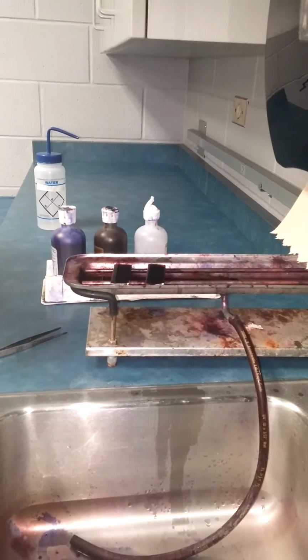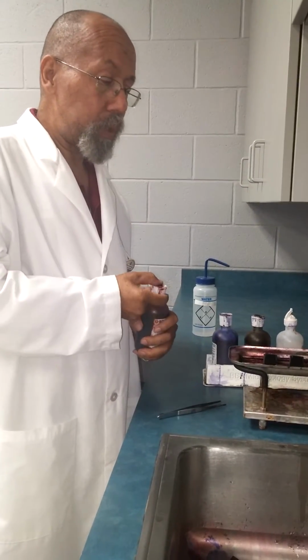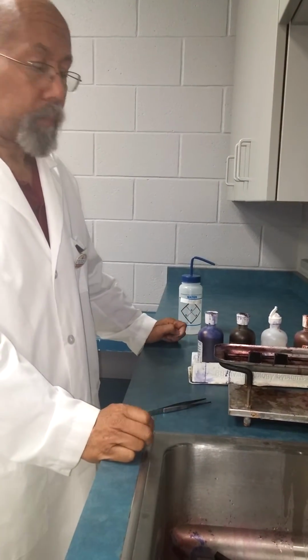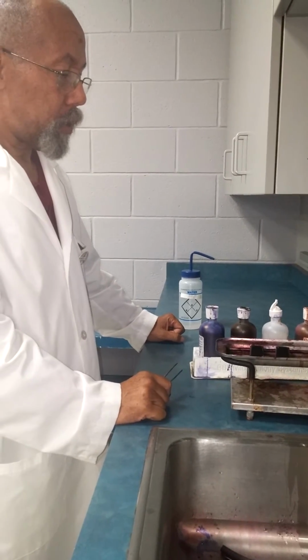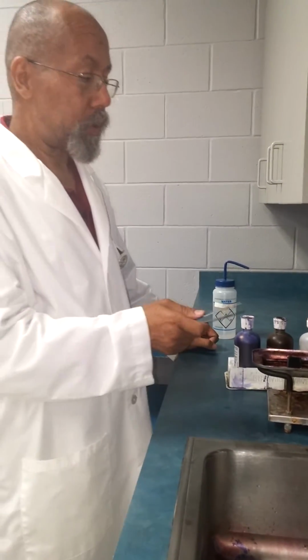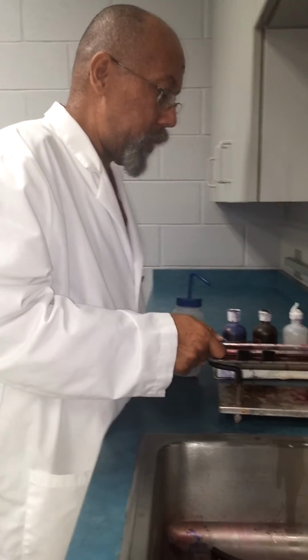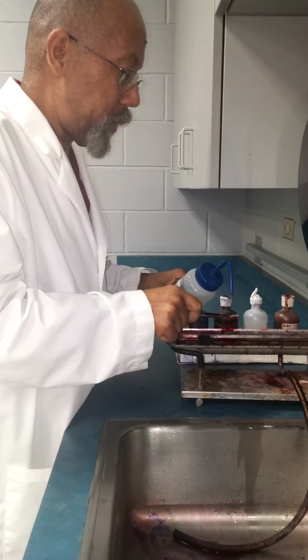And remember that we said that the gram-positive organisms will retain the crystal violet. They'll still be purple. They don't lose that purple color. So after 10 seconds, it's only 10 seconds for the safranin, then we can rinse the slide, rinse off the secondary dye.